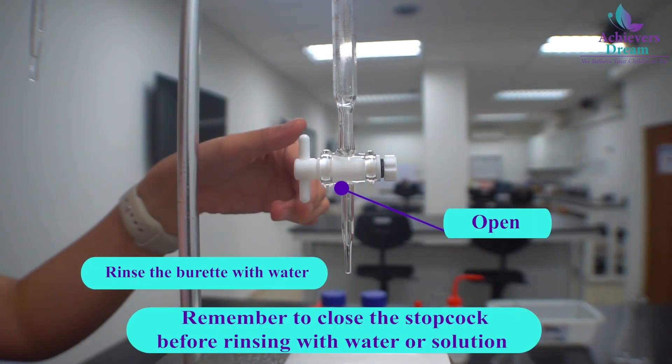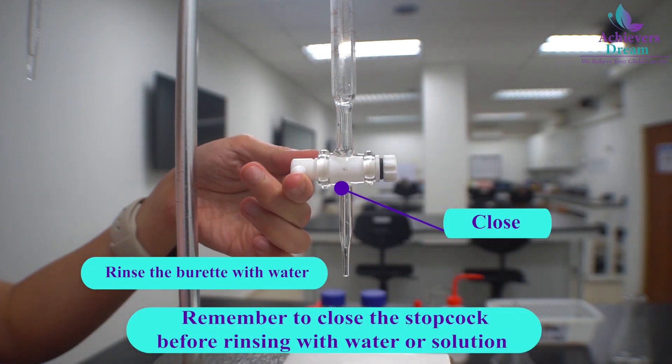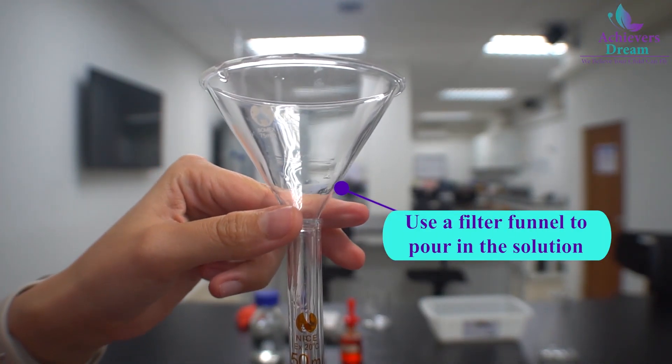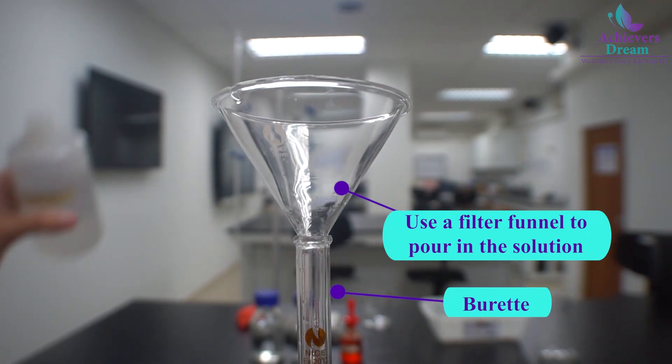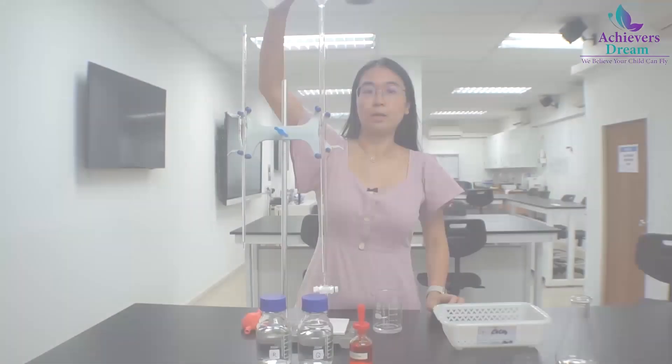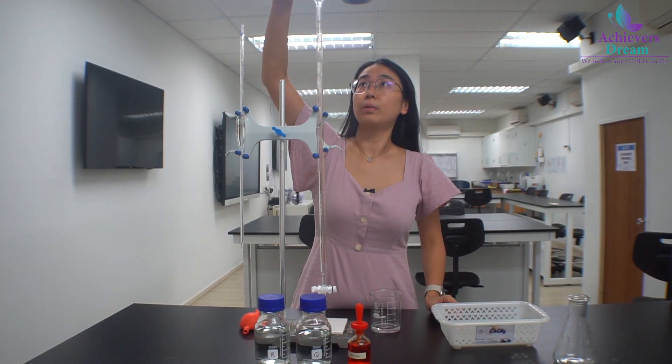Remember to close the stop cork before filling it with distilled water. Use a filter funnel to help pour the distilled water from the top. Fill a third of the burette.